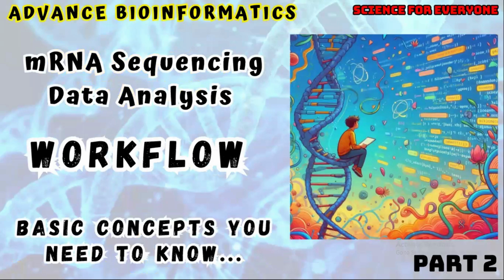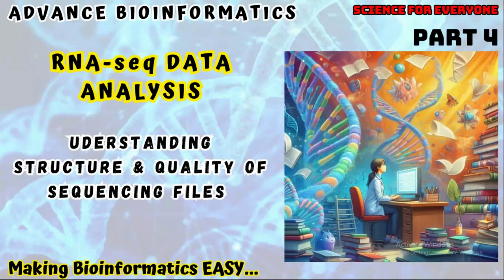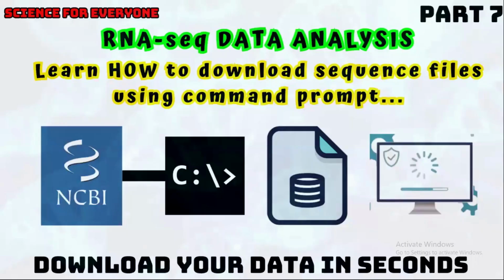Okay, just a brief intro about the previous videos, that I started from the very beginning about the workflow of RNA sequencing data analysis. I explained the sequencing. I also explained the structure and quality of sequencing files. I talked more about the quality of the sequencing files. Then after that, I discussed the biological databases, and how to retrieve our data of interest from them. And after that, through command line, command prompt, I showed you how to download your data.